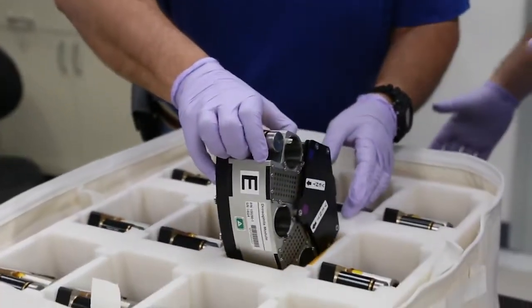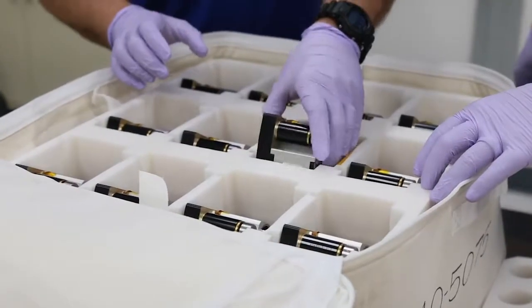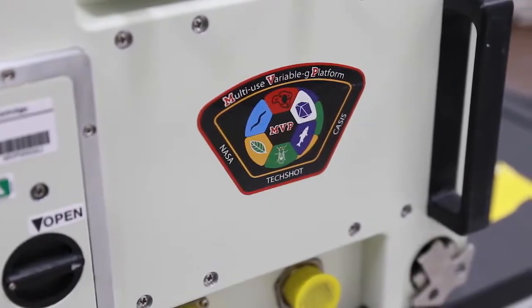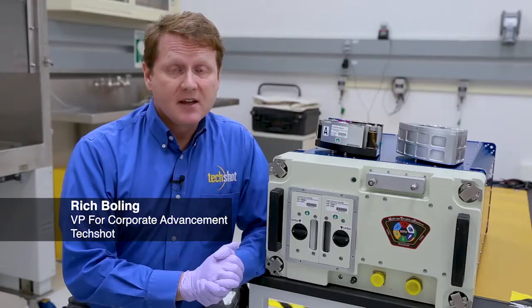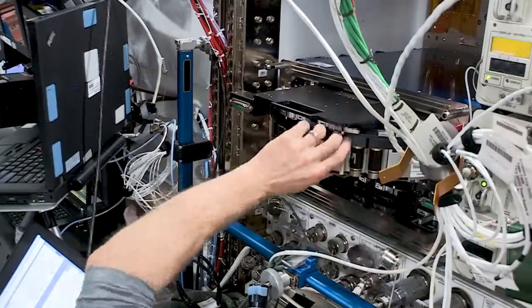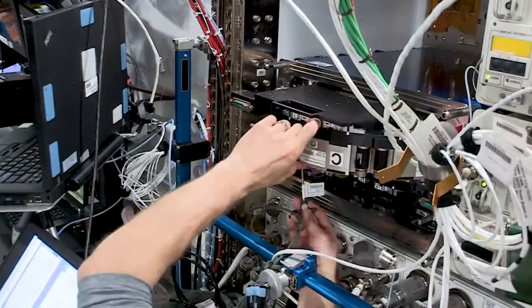We have a very nice new piece of hardware. The company Techshot, we've been working together with them for the last few years in developing a very capable piece of hardware. What's so special about the Techshot MVP is that there are two internal carousels inside the unit, and each one of them can produce anywhere from 0 to 2 Gs. So it'll be the only payload of its kind in the US segment that can do this.